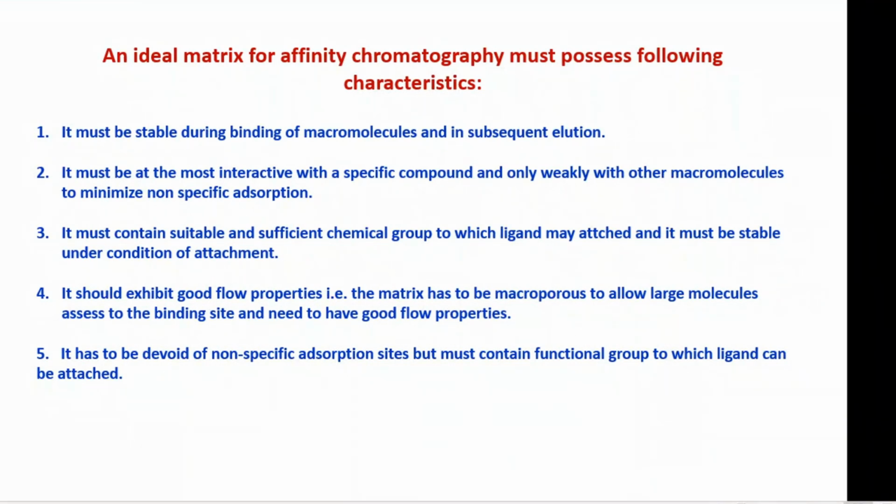So that means when we place some mobile phase on top of it, it should allow the movement of that mobile phase from top to the bottom. It should not be completely packed without passing any material. So it should allow the passage of the molecules, and it should exhibit the flow properties, right?